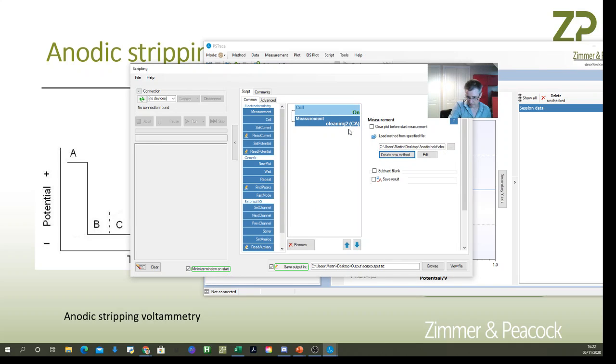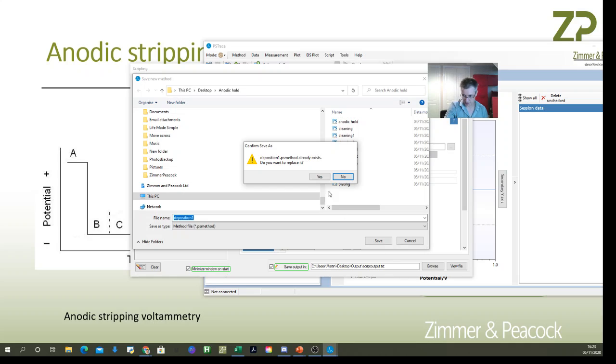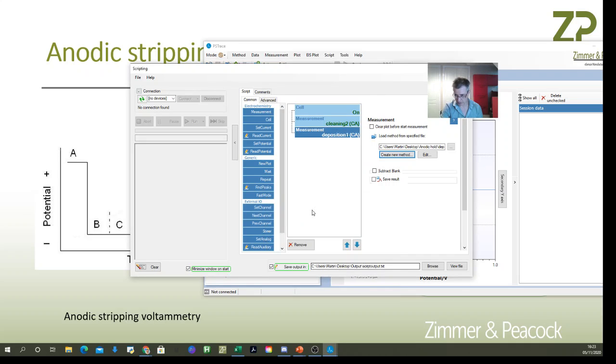Next I set up the electrochemical deposition step. I'll call it 'deposition' and edit it to apply negative 1.5 volts, with a save rate of one per second, running for 180 seconds. Save and close that.